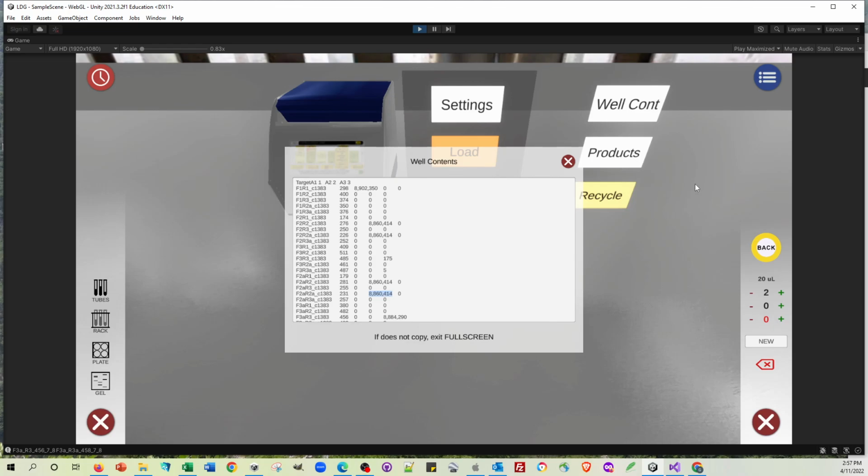So a couple of really big things have happened. This ability to record the well constituents, the ability to recycle, the ability to get lots of different reference TMs for each of the primers and generate more and more off-target binding, which results in more amplicons.